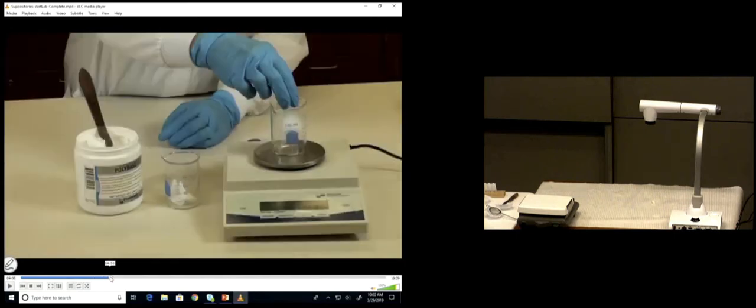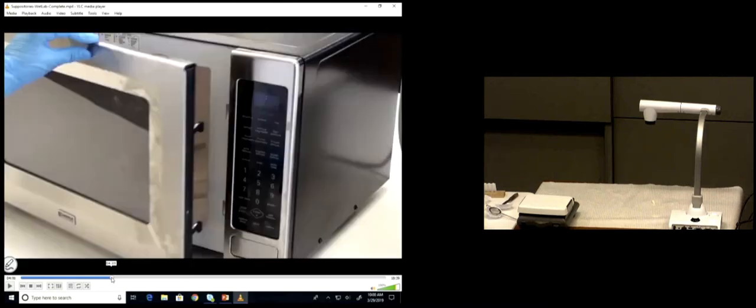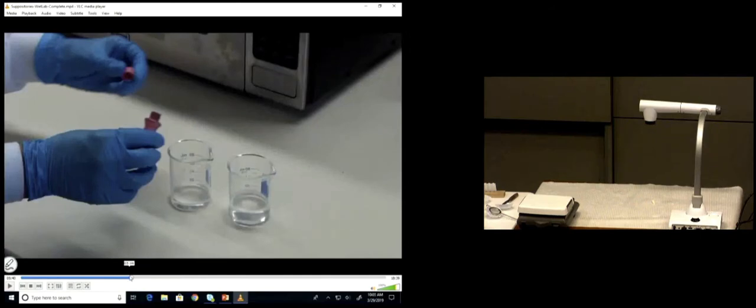You're using this, okay? So in the end, would you agree, you've got 1 beaker with how much? 12 grams, 1 beaker with 30 grams, all right? What are you going to do? You're going to go over to the microwaves in the middle. You're going to put them both in there and microwave for how long? 30 seconds. Can you believe I made you watch all 30 seconds in the video? All right, so you're going to microwave it for 30 seconds. And then you're going to pull it out, all right? Obviously, one of them is going to have less liquid than the other one.